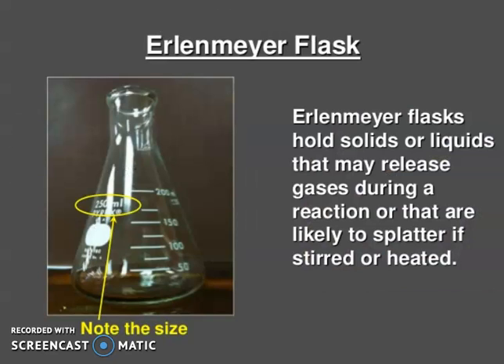Now Erlenmeyer flask. Erlenmeyer flask holds solids or liquids that may release gases during a reaction or that are likely to splatter if stirred or heated. Note the size. This is the size, 250 milliliter.